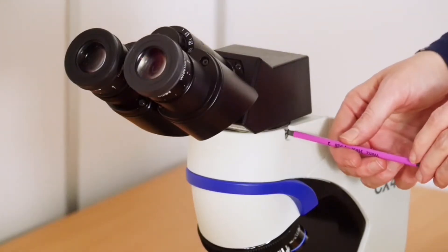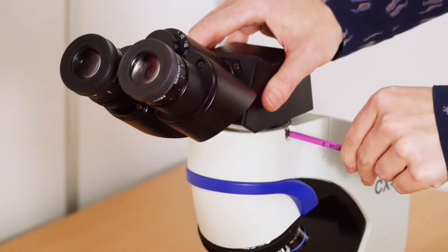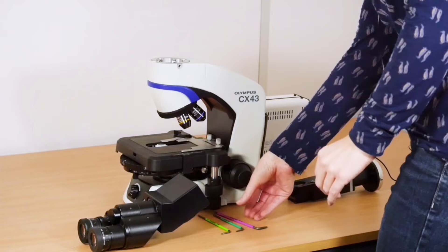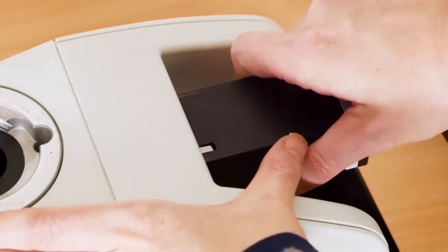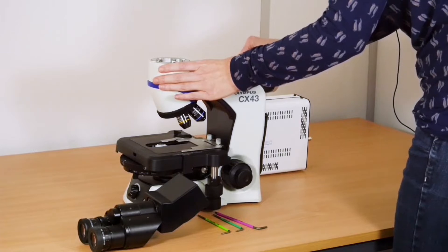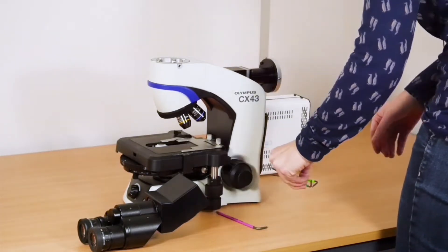Firstly, remove the eyepieces and then insert the adapter to the back of the microscope. There's a screw that prevents it coming back out, so you just need to pull that gently as far out as you can. Then it's time to attach the light source.